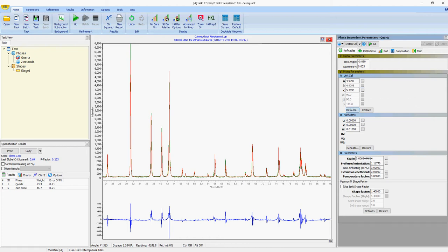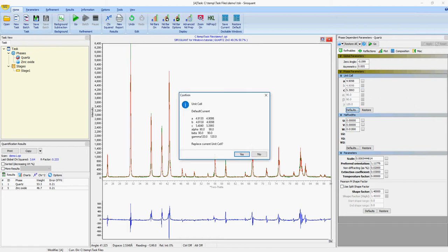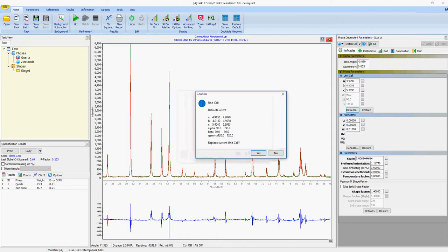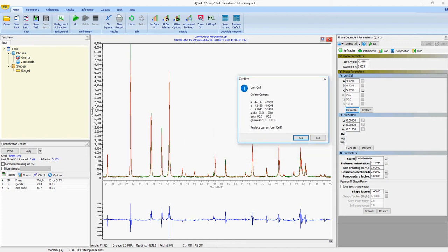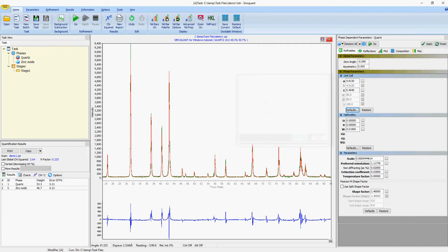If you want to check what the refinable parameters were at the start of the task before you've done any refinements, you can click the default button and it will give you a comparison from the default and the current values. By clicking replace unit cell, you can also replace everything back to the default, so if you basically want to restart your refinements on a particular phase, you can just restore from the defaults.